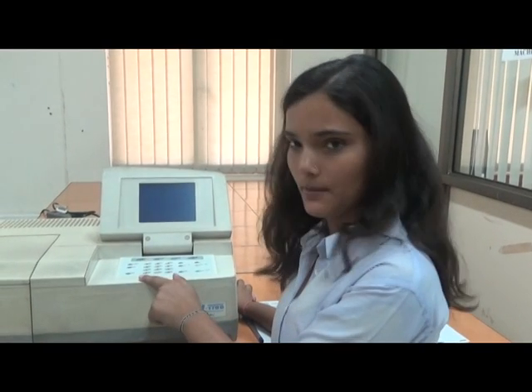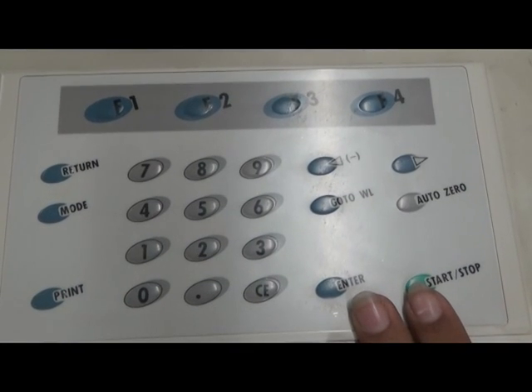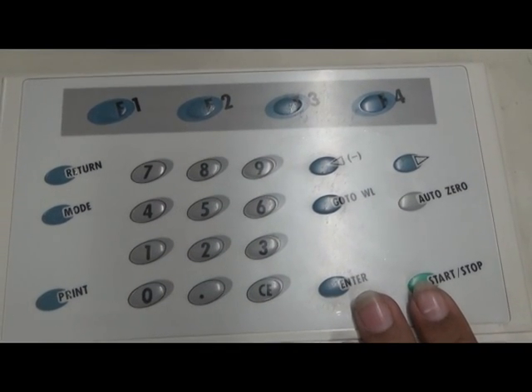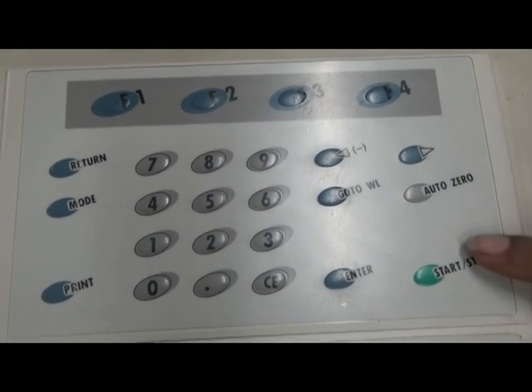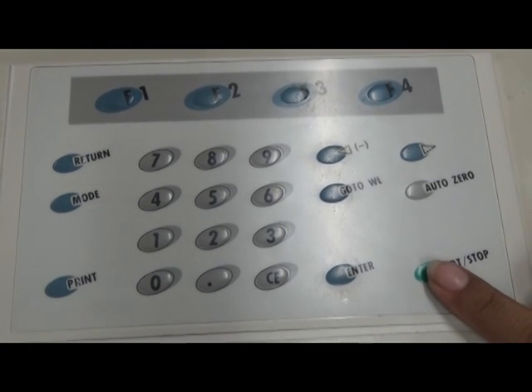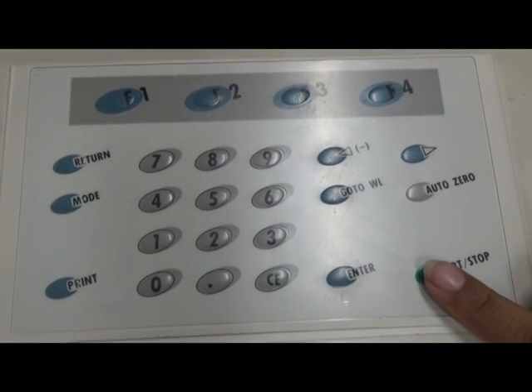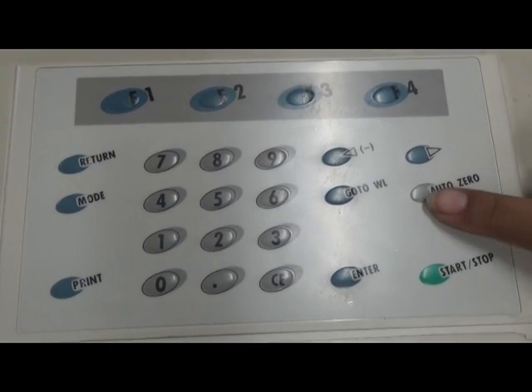Now we will discuss the keyboard of this device, the spectrophotometer. This is the input component for giving operation commands and numeric values to the instrument. This is the start-stop key. This is the key for starting and stopping measurement once parameter setting has been completed.